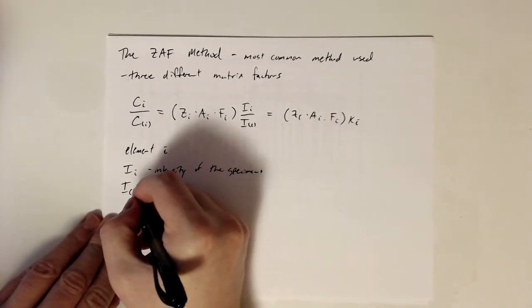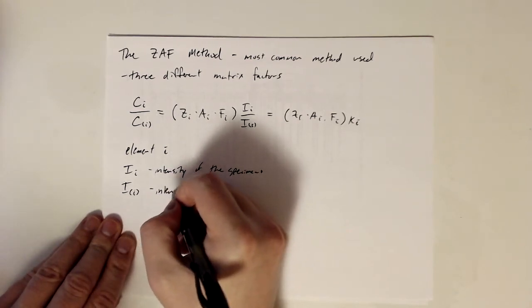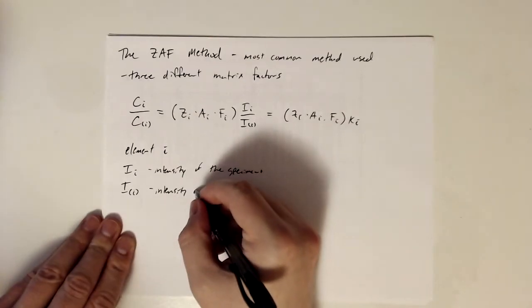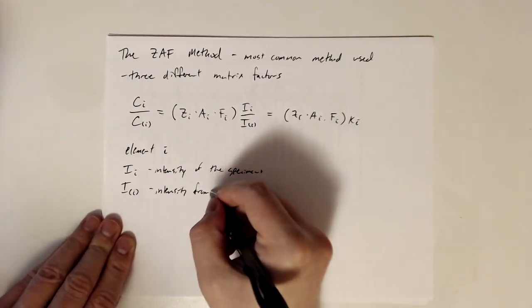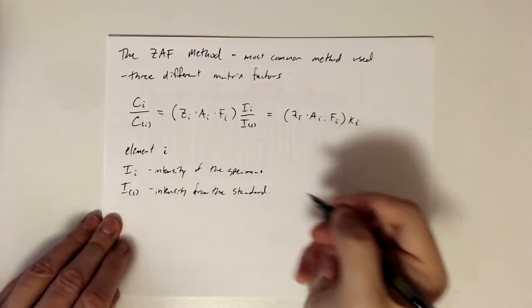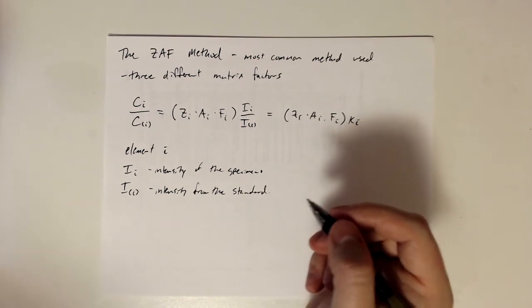When we have the parentheses around it, this means the standard, so it's the element in the standard. Those have the same meanings throughout.